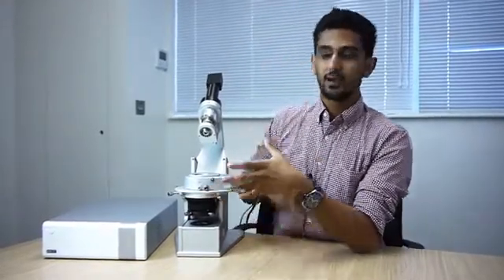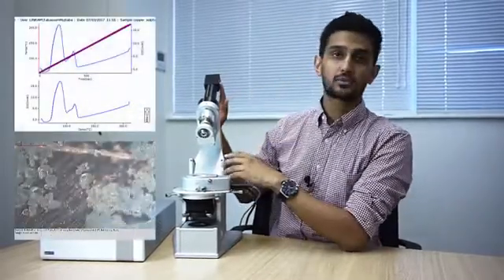Now what this system allows you to do is combine the DSC data from this stage with optical images captured here with our imaging station and camera setup. You can also use your own third party microscope.